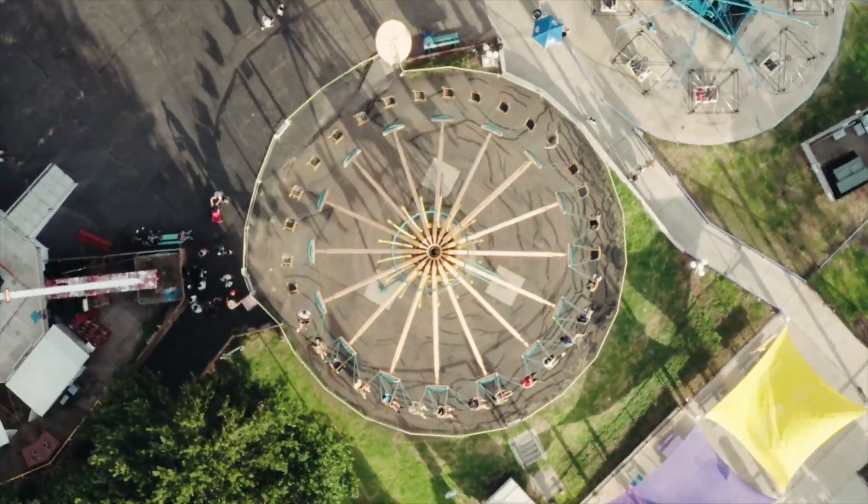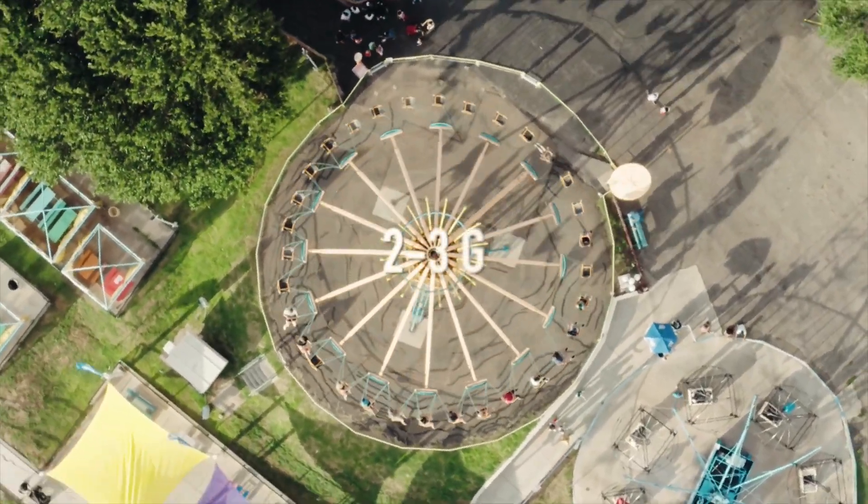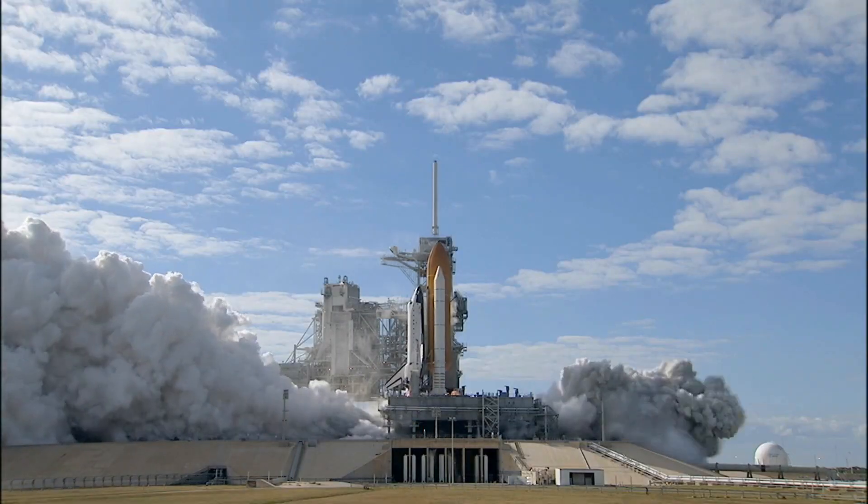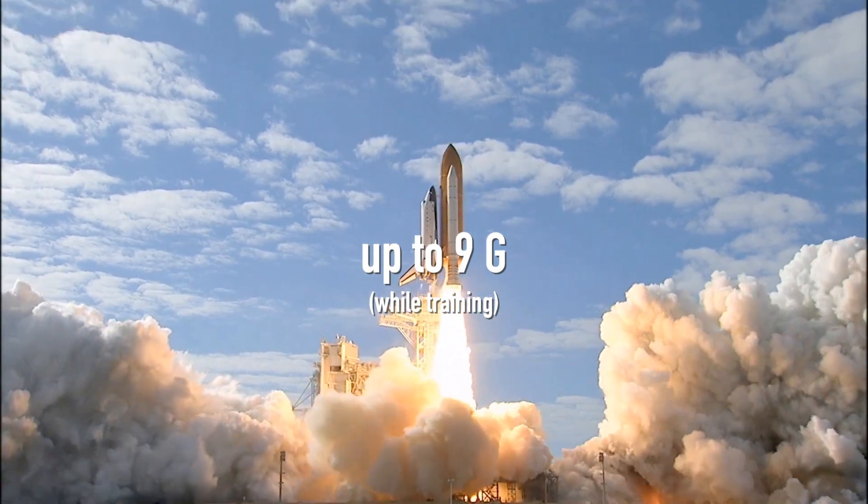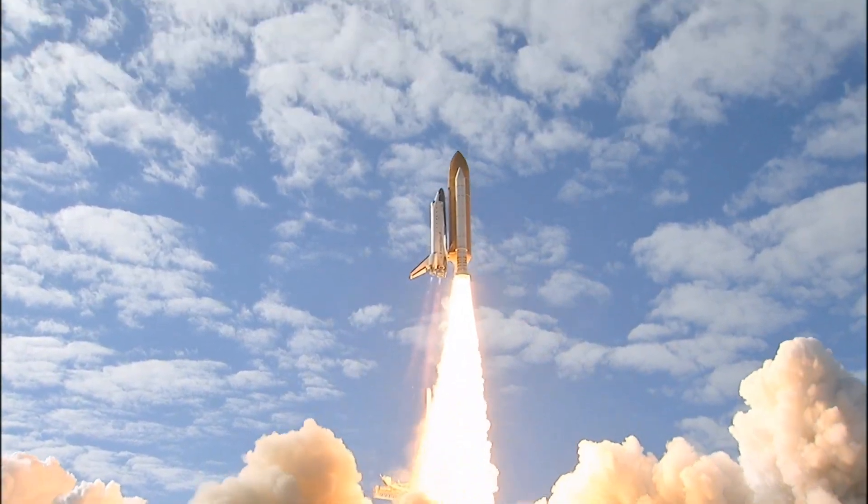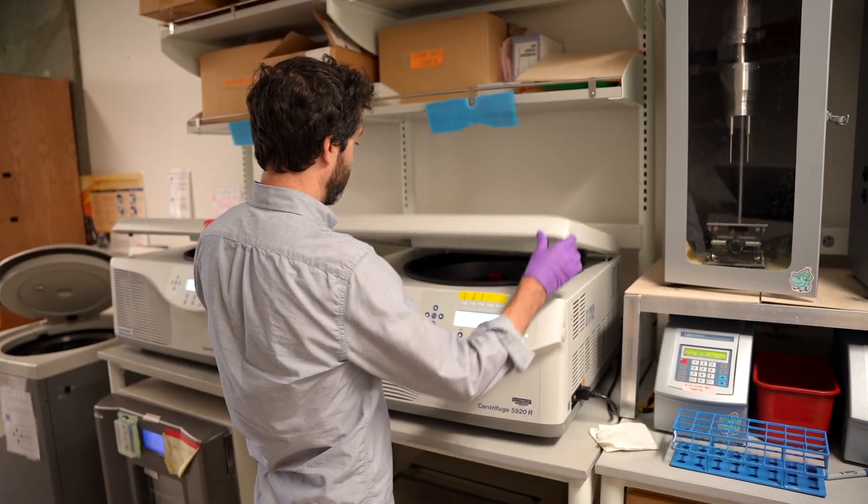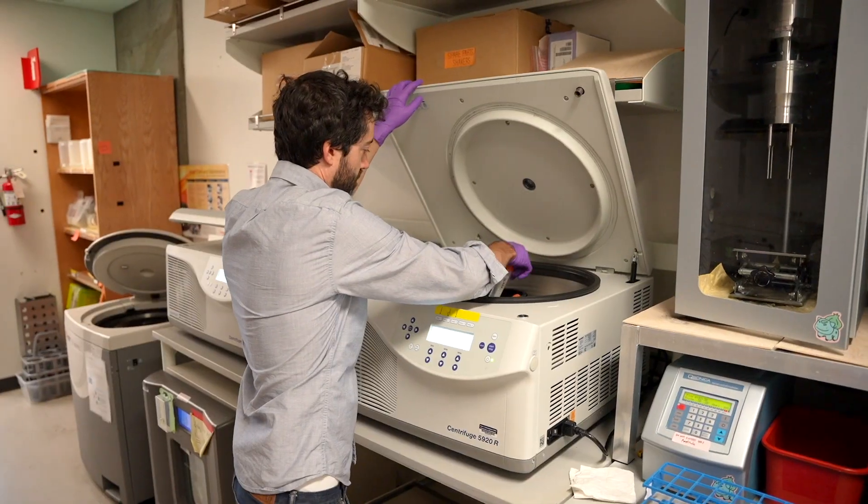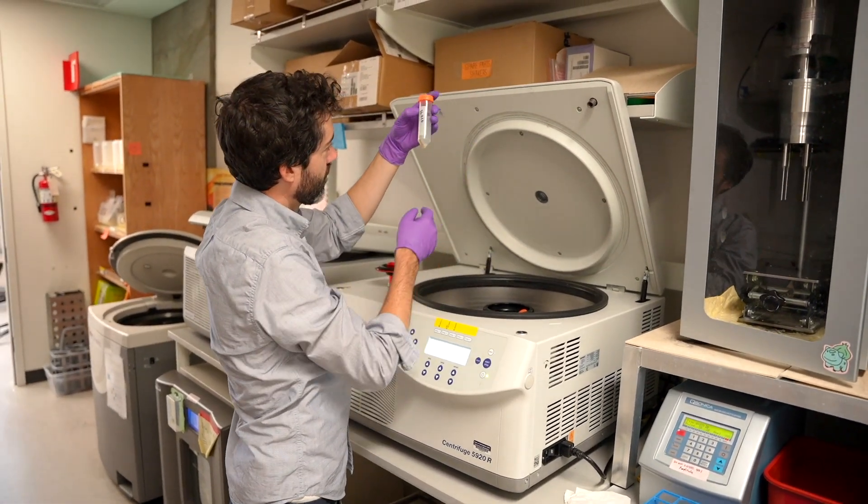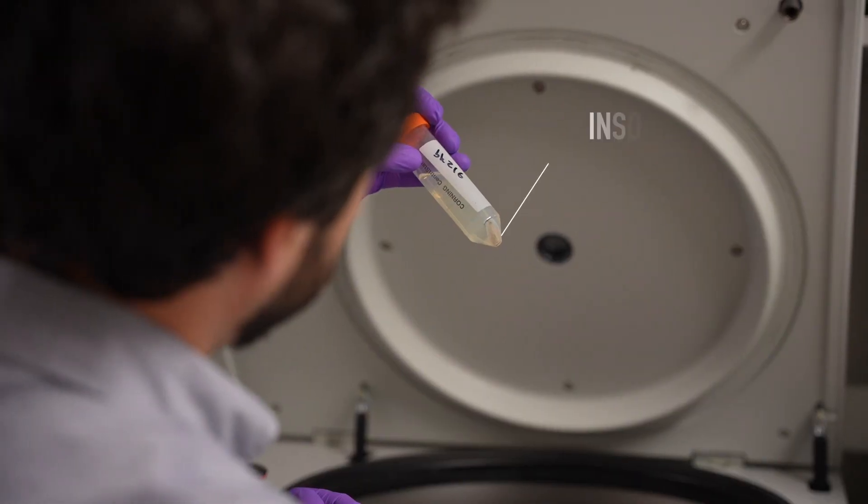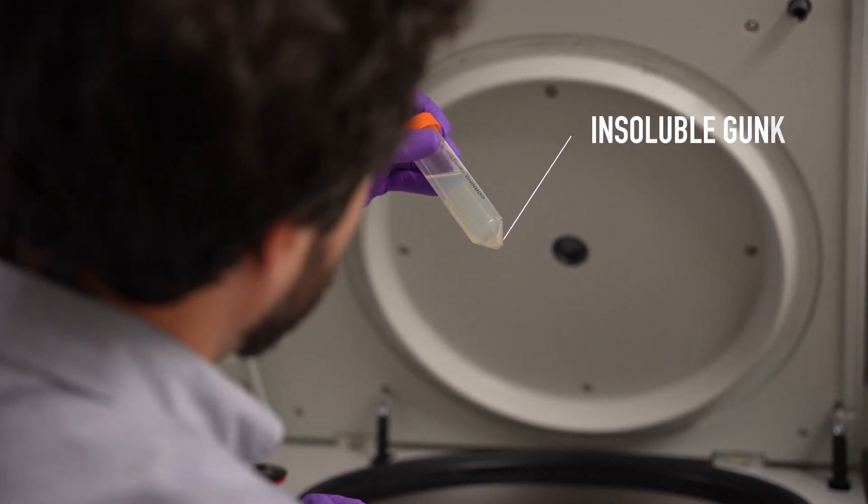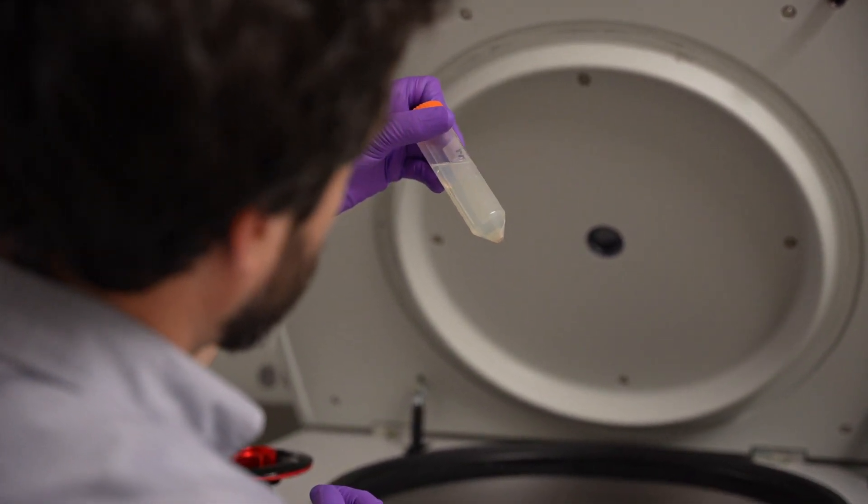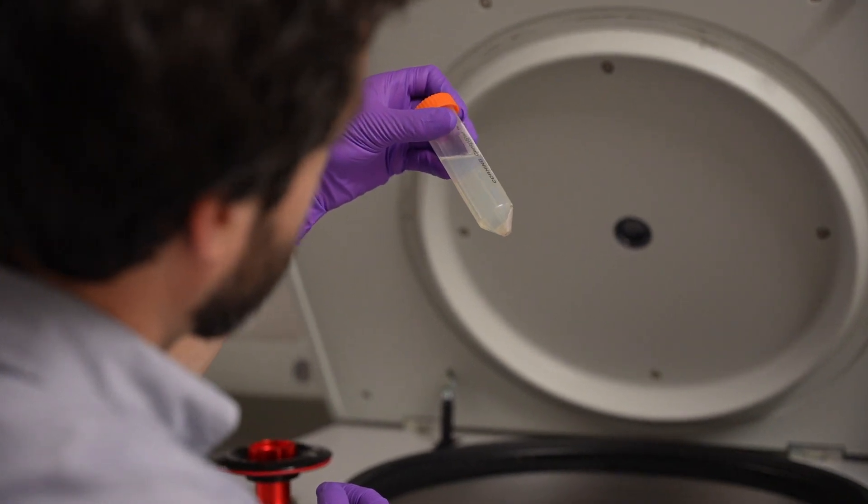For reference, a carnival ride might top out at two or three times Earth's gravity. Astronauts can sometimes endure about nine times the force of gravity before passing out, but that's only for a few seconds. After the centrifuge has been spinning for about 20 minutes, we can see some insoluble gunk has collected at the bottom of the tube, while all of our soluble proteins are still dissolved in solution. We've successfully separated the insoluble and the soluble molecules.